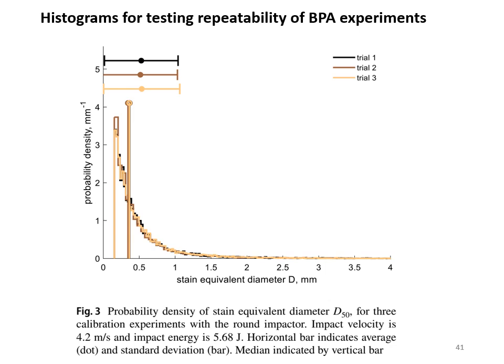And those bars on top show the average, which is pretty much the same between the 3 experiments, and the standard deviation. So with this data, you can get a feeling that your experiment is repeatable, and you can move on to more important things. And if it's not repeatable, it's going to show.